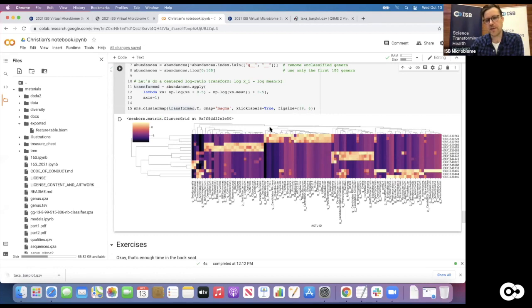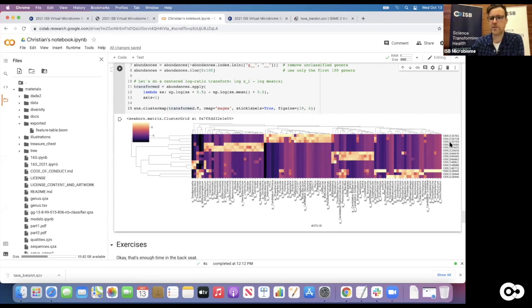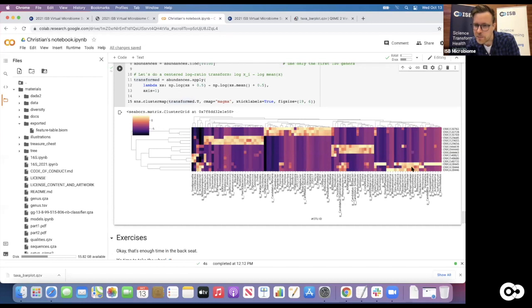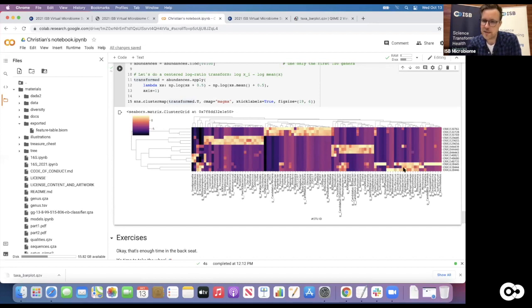You can actually check out the metadata table and verify what those samples came from - every three rows would be a new environment. We could even try to do some detective work and try to figure out what those environments are. For the lowest one here, we have a lot of Sulfibacter, Microspira - that looks like a fairly separated environment. Maybe it's a specific environment type given those organisms that are particular to it.